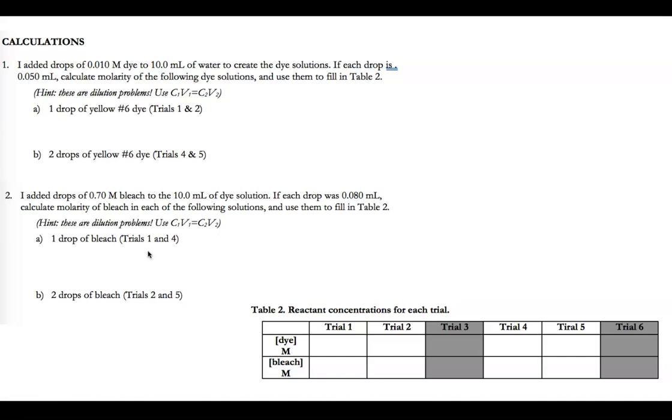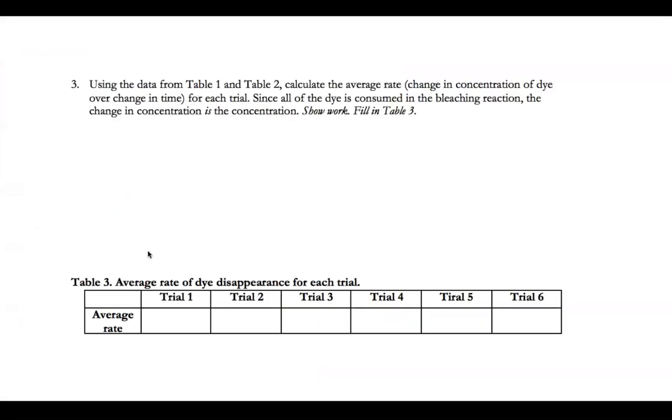And so there's definitely going to be some error in our calculations. So this is really more of an exercise to demonstrate rates and rate laws, but do not take this as actual good lab data.